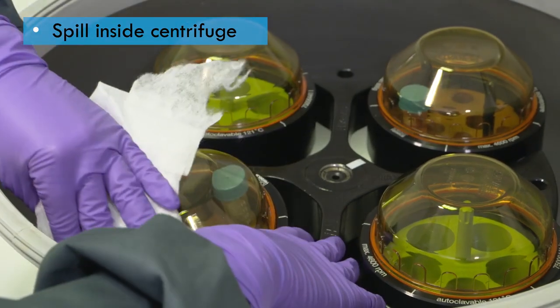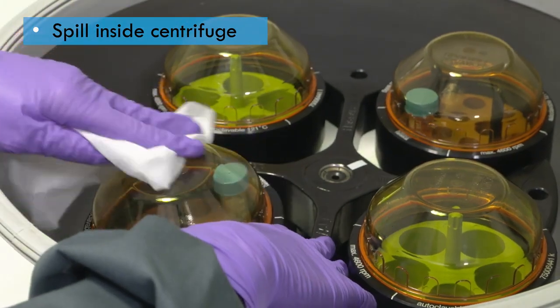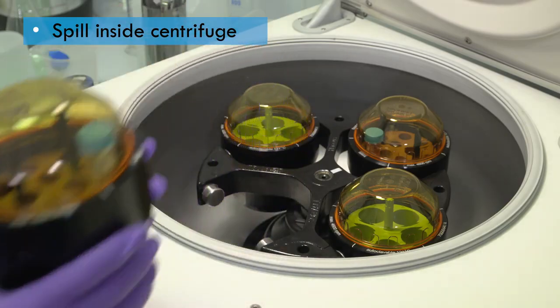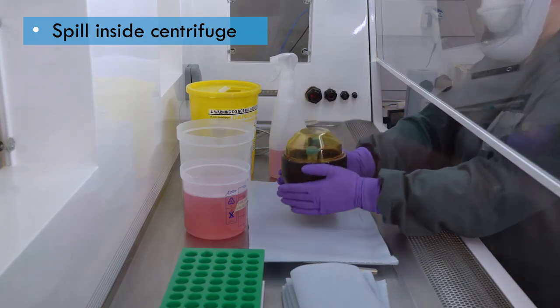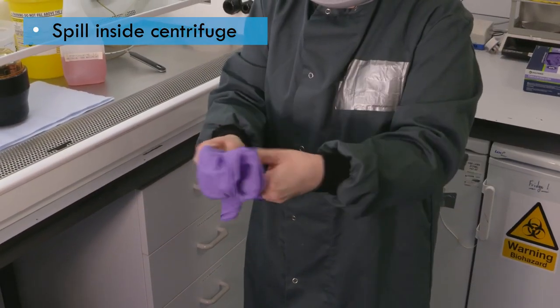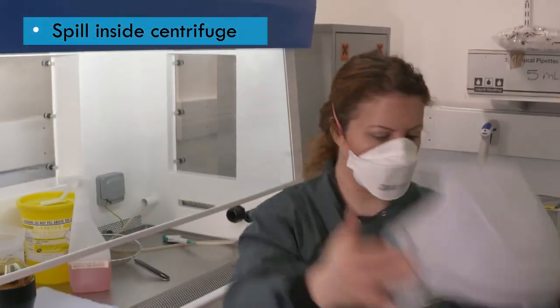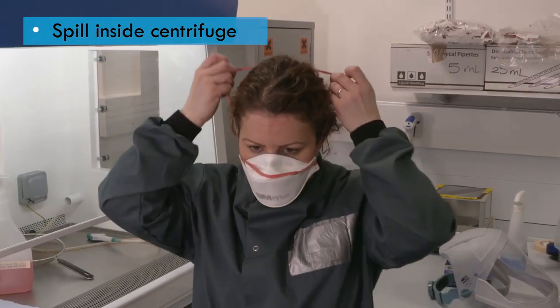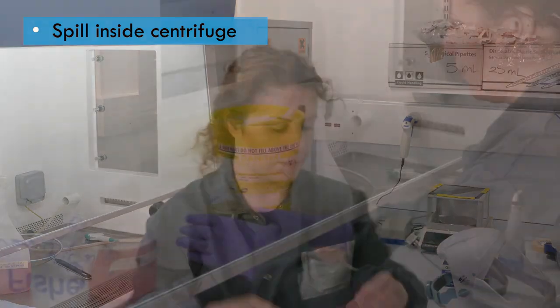Carry out surface decontamination of the sealed bucket or rotor in situ before transferring it to the nearest biosafety cabinet. The eye and respiratory protection can now be removed, as the biosafety cabinet will contain any further aerosols or spills.